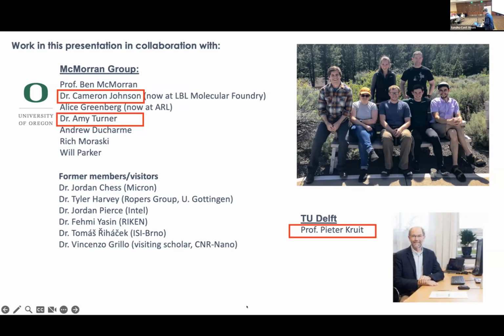So I don't know if you can count phase contrast as an interaction or not. I think I would. But the fact is, the probability of doing damage is still there. So there are some other tricks. You can use your scattered electrons. There are detectors where you can look at the electrons scattered at some angle, so you can actually measure whether they hit your object or not.